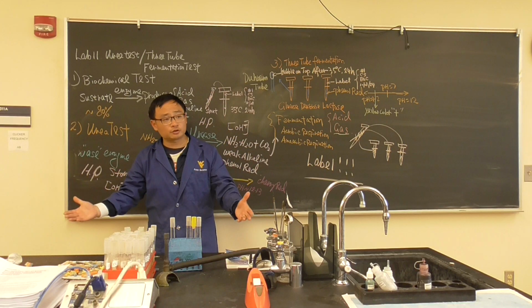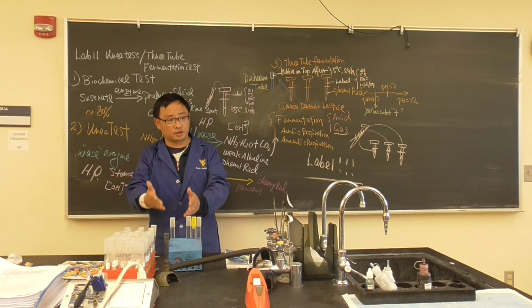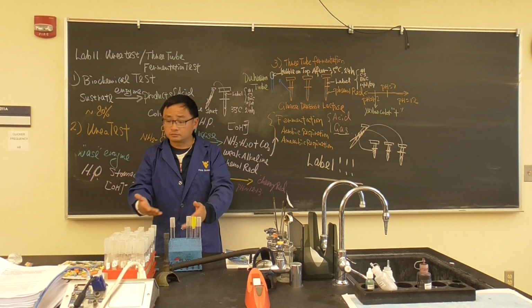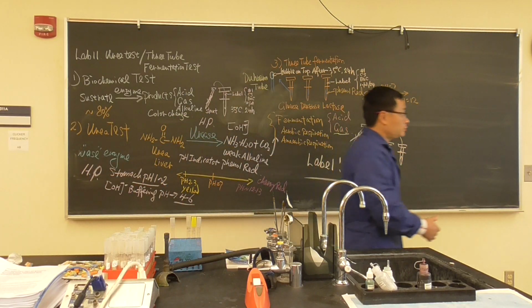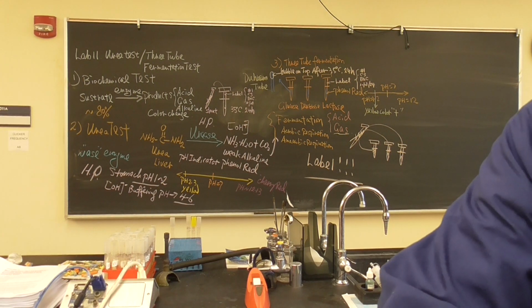It is not difficult to do. However, you need to do a good job of the inoculation. Make sure there is no cross-contamination, because otherwise, what will happen? It's all going to look the same. Okay? So, that's all I have, because I have a meeting real quick, and Rion will take care of it.